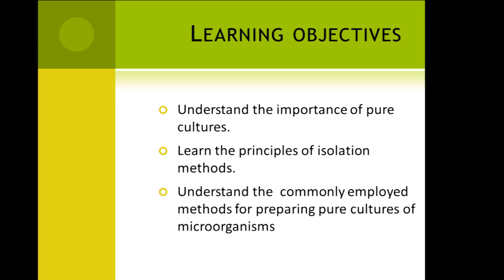So here, the learning objectives of this lesson are to understand the importance of pure cultures, to learn the principles of isolation methods, and to understand the commonly employed methods for preparing pure cultures of microorganisms in the laboratory.